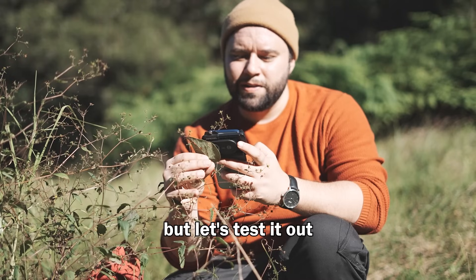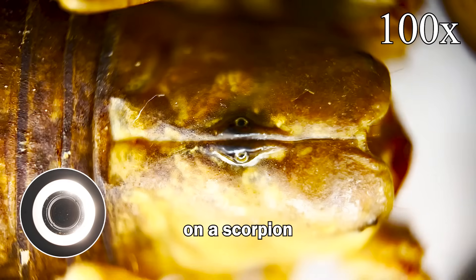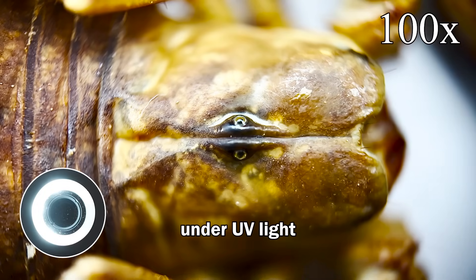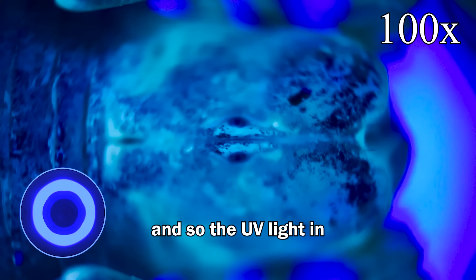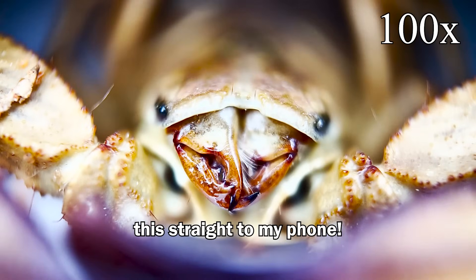This is all really cool, but let's test it out with a real sample. I'm testing the Phone Micro 5 by Apexel on a scorpion — scorpions glow under UV light, and so the UV light in the device was perfect. The best part about this was I could record it straight to my phone.